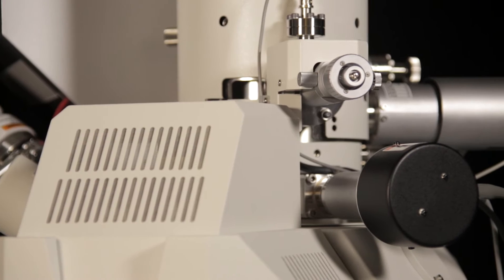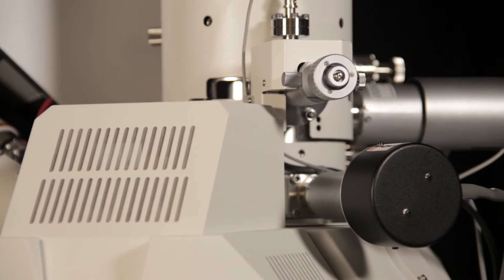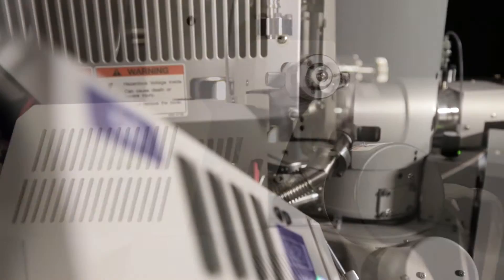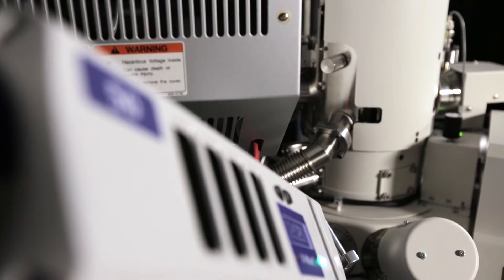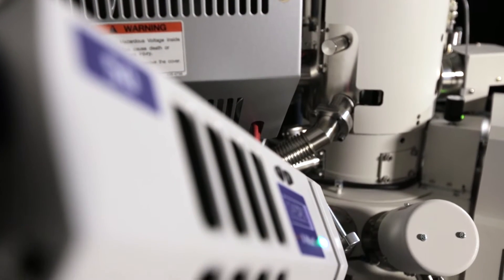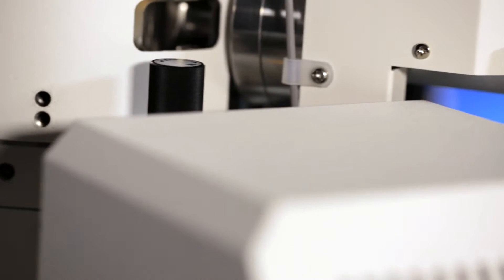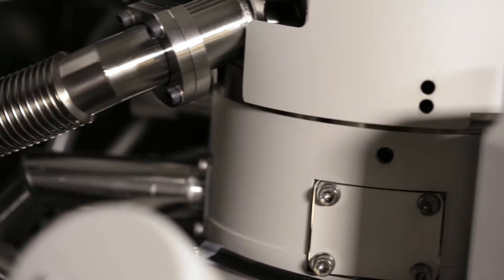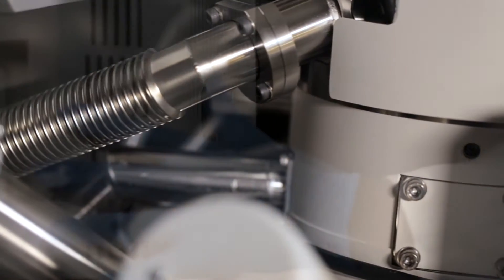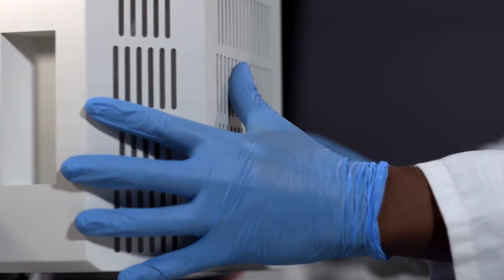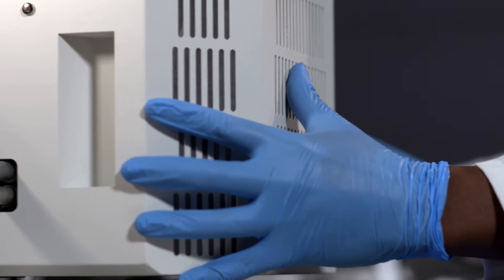Delivering unmatched image quality, particularly in lower accelerating voltage settings, the SU-5000 is an easy to use and versatile instrument with reliability that remains unrivaled in the industry.